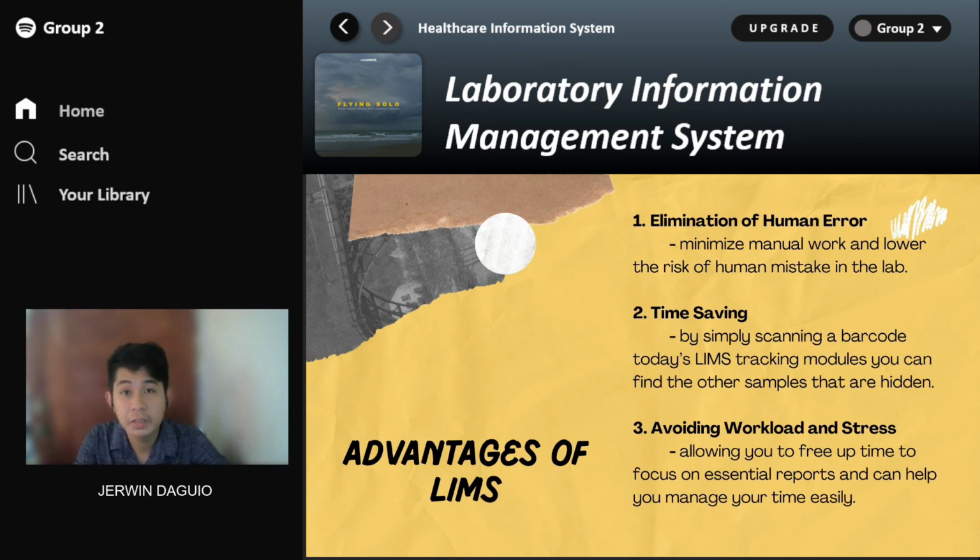The advantages of LIMS, or the Laboratory Information Management System. Number 1. Elimination of human error. As we know, error can cause a lot of misdirection in the information. Modern laboratory information management systems now have the power to automate the data and tasks in a single platform to avoid human error.